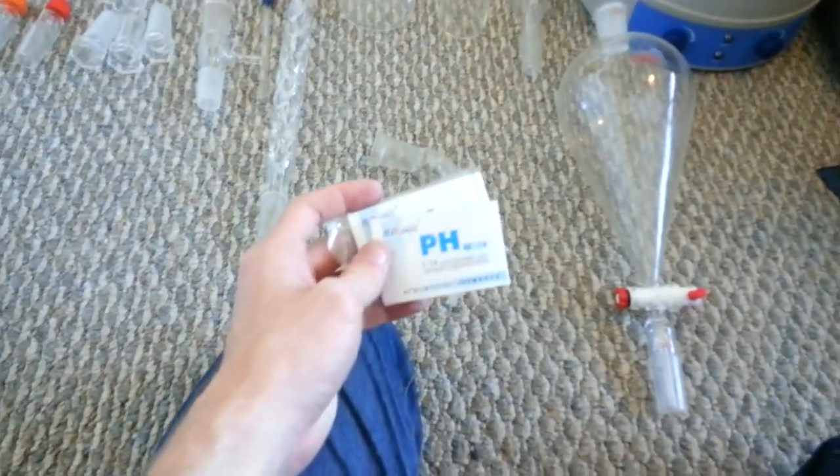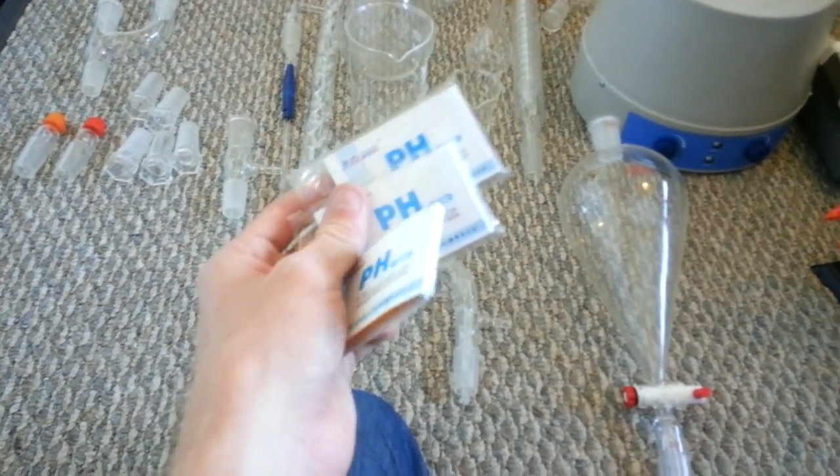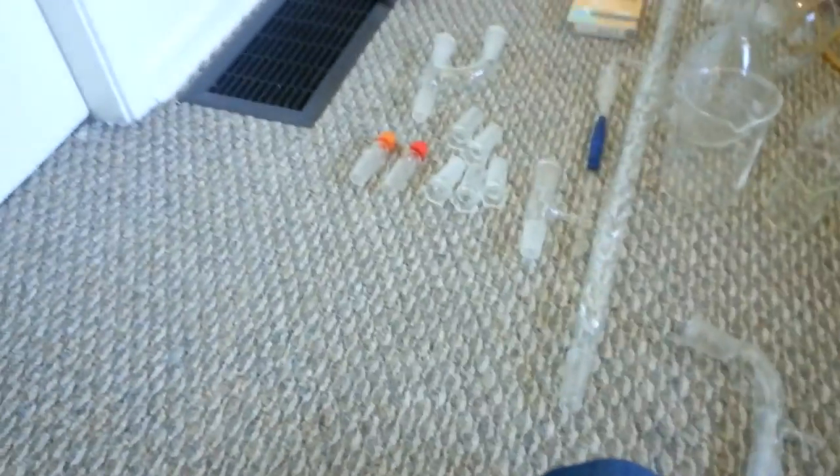pH paper is really good. This pH paper is like $2 for a pack of 100 strips, which will last you a while. I have 10 of these and got them for like $5 total. pH paper is really cheap — you'll use it a lot, so you should get it.